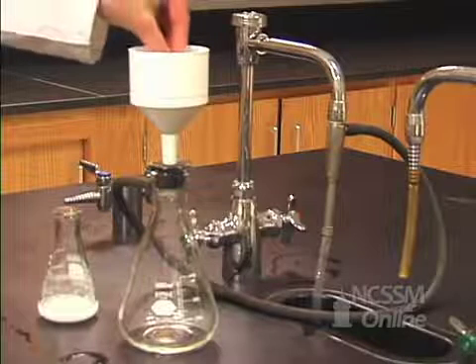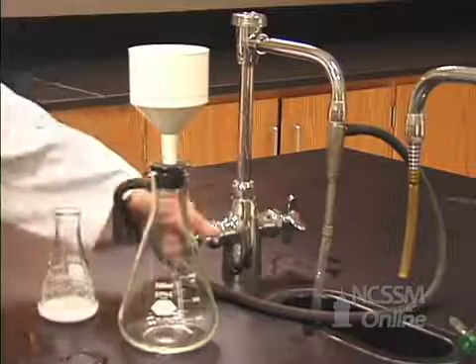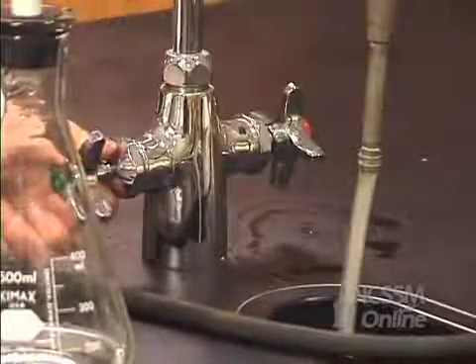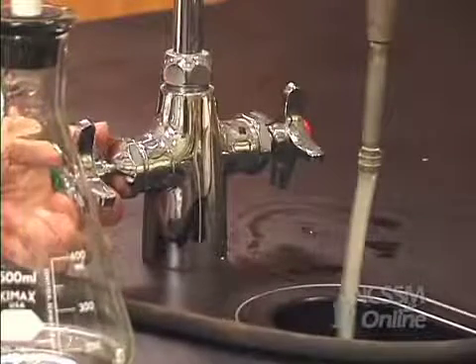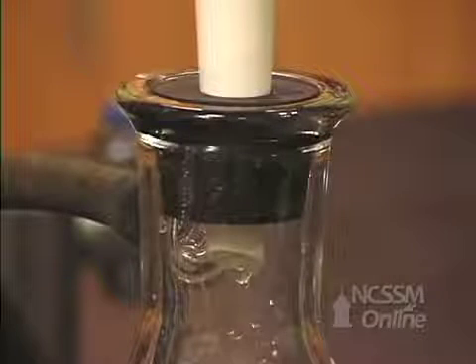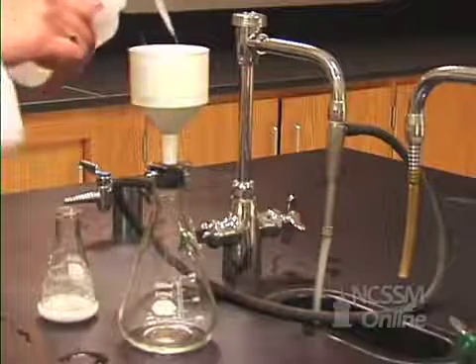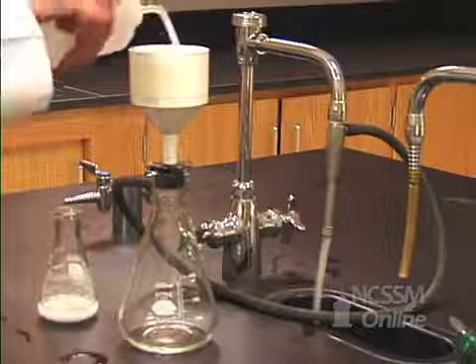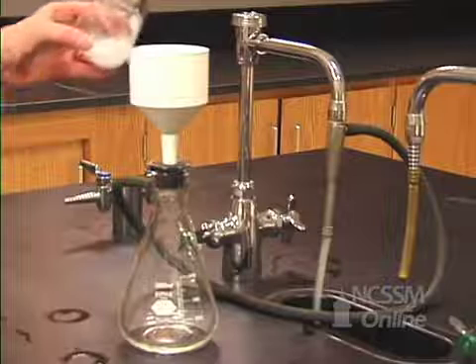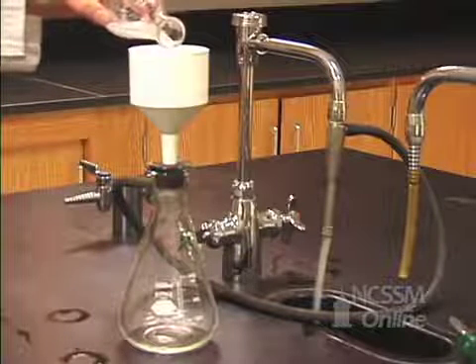We need to put a piece of filter paper inside our funnel, and when we turn the water on, you see water's running down. That running water creates this low pressure here. We'll use just a little bit of water to make a nice tight seal, and then we'll pour our aspirin solution into the funnel.